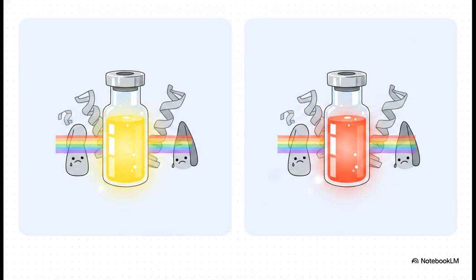Once the reaction is frozen, the magic really happens. That leftover, unreacted hydrogen peroxide binds to these transition metals and forms a complex that turns a highly visible color. With titanium, it turns this bright yellow per-titanic acid, read at 405 nanometers. With vanadium, it forms a red-orange complex peaking at 452 nanometers.